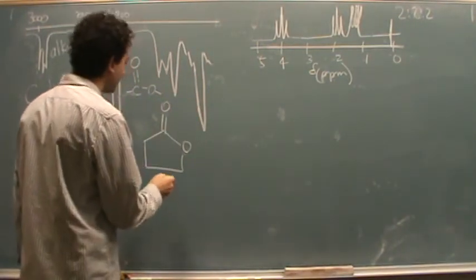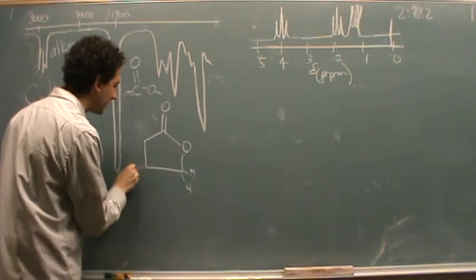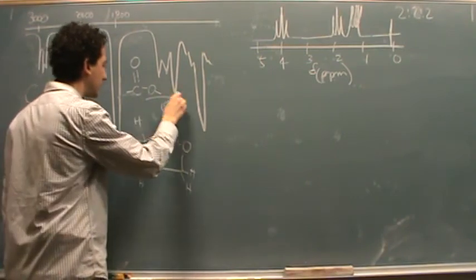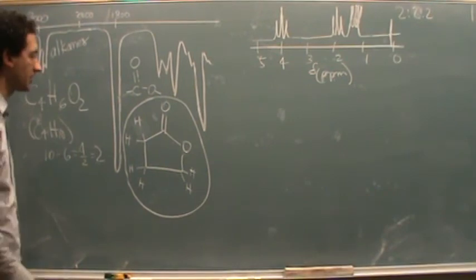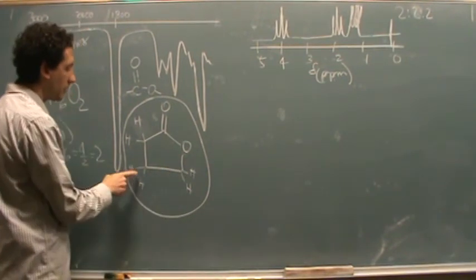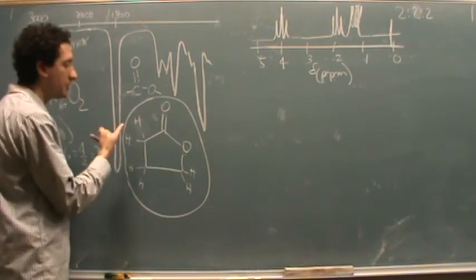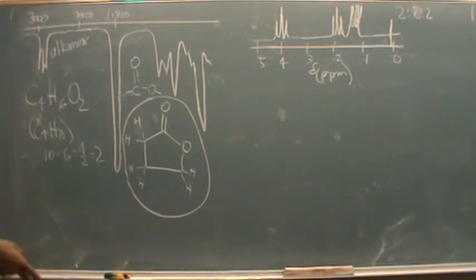So, for example, in this diagram, or what I think the molecule is, okay, so I think it's this. Let's just confirm this with the NMR before I'm really sure. This would give a 1, 2, plus 1, 3 triplet. This one would give a 1, 2, plus 1 triplet. And this one would give 1, 2, 3, 4, plus 1, a quintet, or really a multiplet. Sometimes after you get above 4, it's hard to recognize the quintets or sextets, etc.